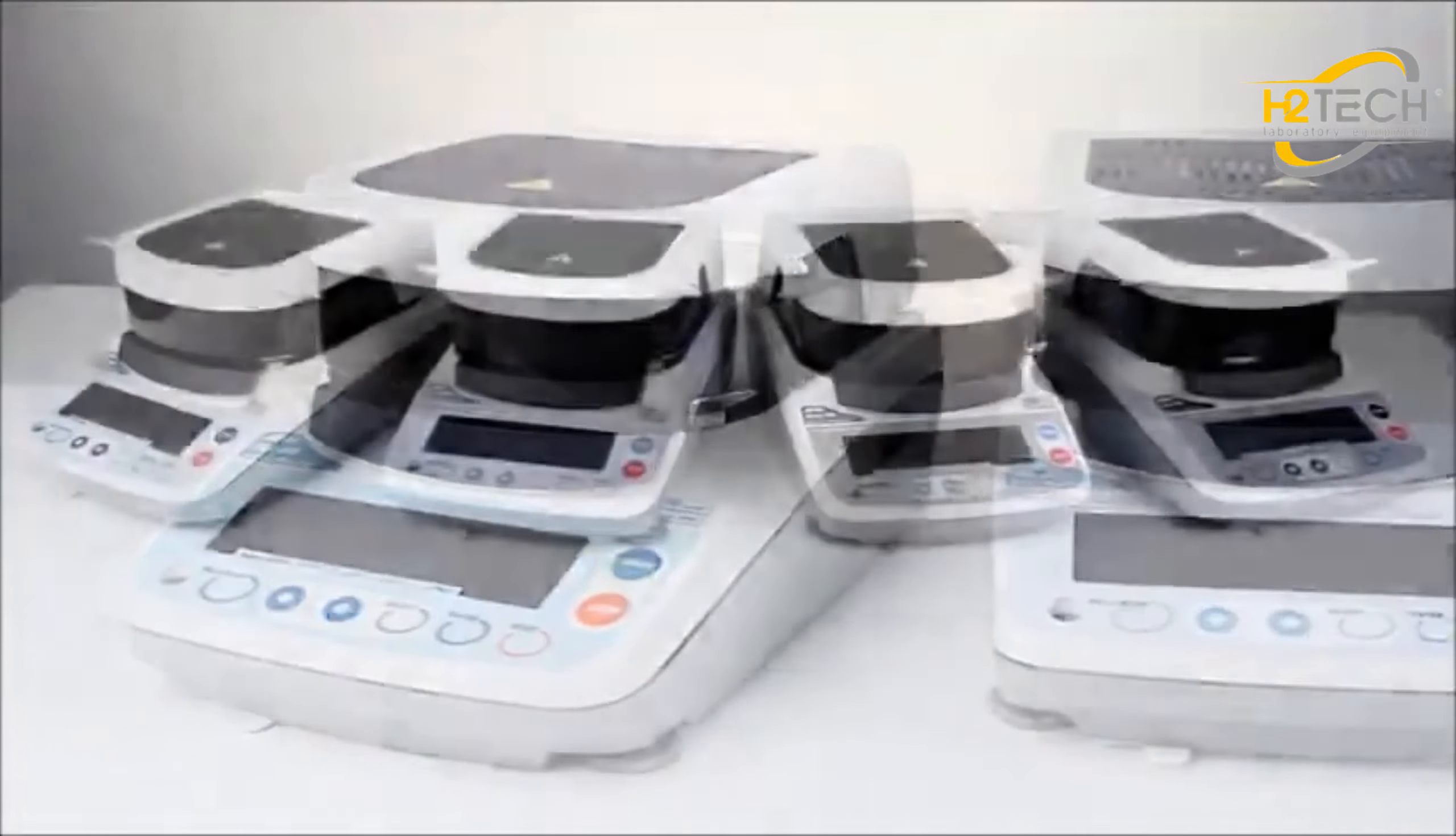Accurate, affordable, and fast, the A&D family of moisture analyzers puts you in control.